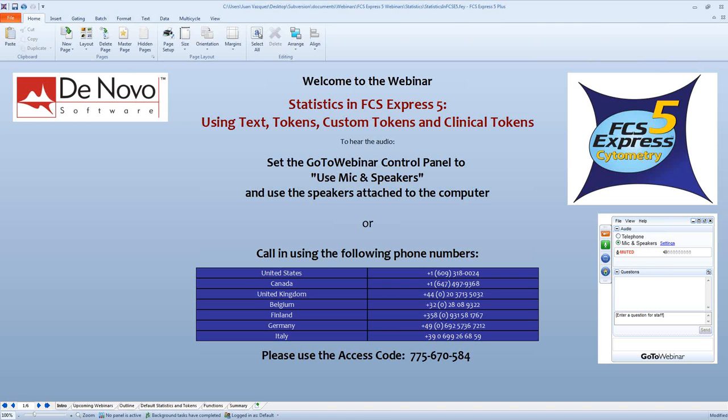Thank you for joining us in today's webinar, Statistics in FCS Express 5 using text tokens, custom tokens, and clinical tokens. We're going to go over quite a bit of material as it relates to statistics, some of the default stats, the tokens that we can use in FCS Express. We're going to talk about some of the new tokens that are available in FCS Express 5. We're going to talk about making custom tokens, and we're also going to talk about how to create functions using some of the functions that are available in FCS Express and some of the new functions that are available in FCS Express 5.